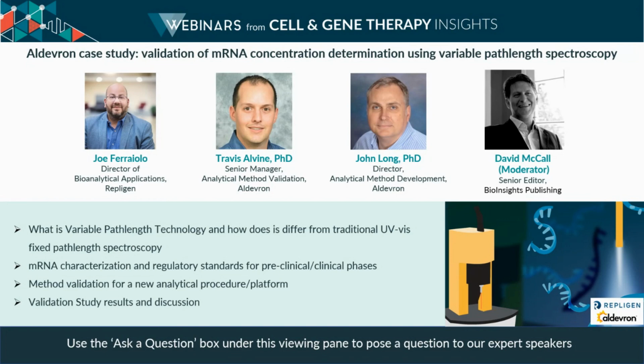Joe Ferraiolo leads the Bioanalytics Applications team and is in charge of the SoloVPE variable path length spectroscopy system for at-line applications. He specializes in UV analysis and leads the development and commercialization of high-value products and flexible solutions that address critical steps in the production of biologics. Travis Alvine leads the Analytical Method Validation Group and manages analytical method validation, method transfer, and method implementation into the quality control release laboratory at Aldevron's Fargo location.